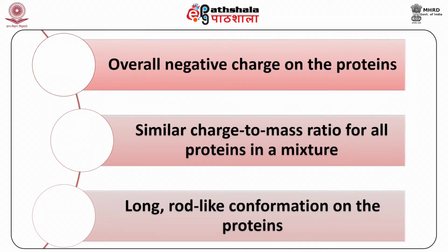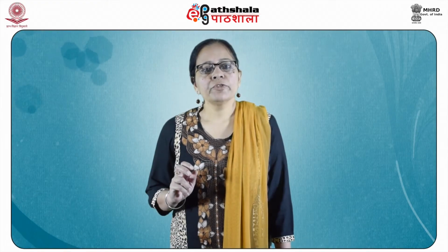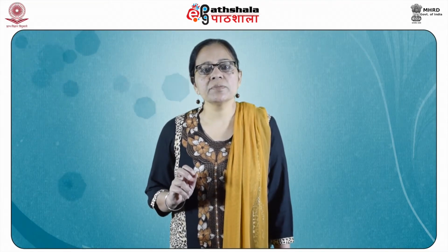This gives a similar charge to mass ratio for all proteins in the mixture, since SDS binds at a consistent ratio of 1.4 grams SDS per 1 gram protein, a stoichiometry of about 1 SDS molecule per 2 amino acids. This gives a long rod-like conformation on the proteins instead of a complex tertiary shape. So therefore, migration of SDS-coated protein totally depends on its size.